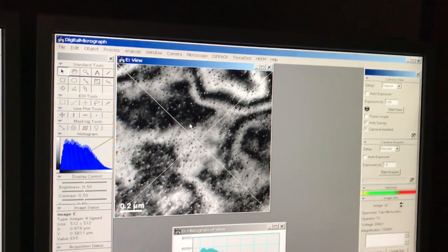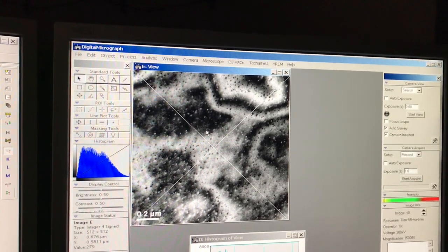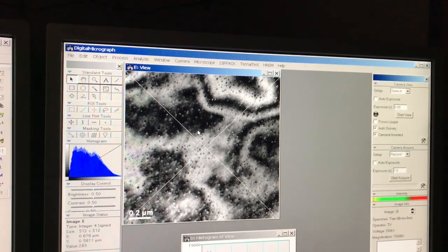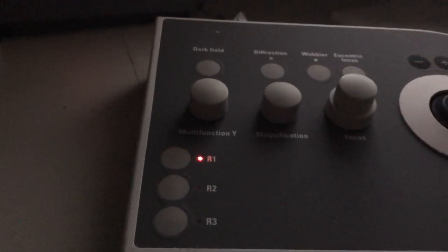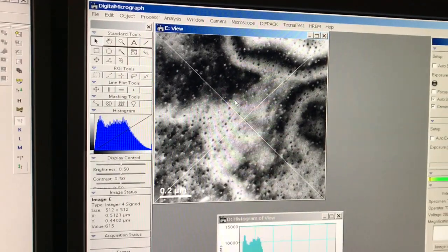Okay, so you can see a few different features here in the bright field image. So the little dots are the faulted dislocation loops. And actually, I'm going to go up in magnification just one setting here because it's going to make this a little bit easier to do. So again, if we want to do that, come back here, put the viewing screen down. I went up to indicated 17,000x. Okay, resize the beam so we're a little bit bigger. Alright, so it's a little bit easier to see those now.